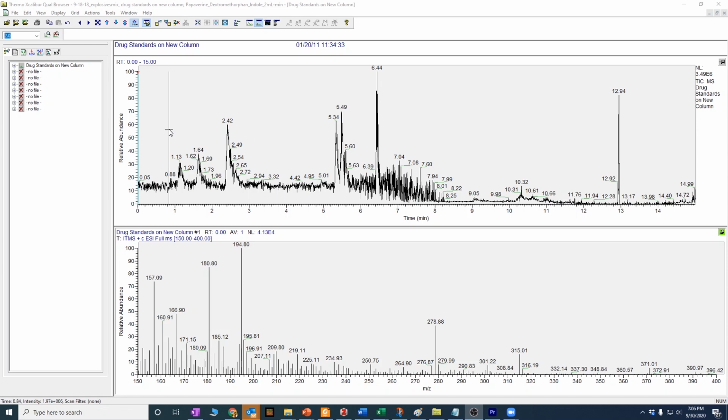We're going to look at some mass spectrometry data now, and again, in a little bit, we're going to spend a good amount of time on mass spectrometry. For right now, you don't need to have an in-depth understanding of mass spectrometry. I'll give you a very cursory explanation, but I do expect you to understand it as explained in this video. We won't get into the mechanisms of how this happens, but there are different types of mass spectrometers, and the type of mass spectrometer that you hook up to an LC to use as a detector is going to give you the signal for essentially the molar mass of the compound.